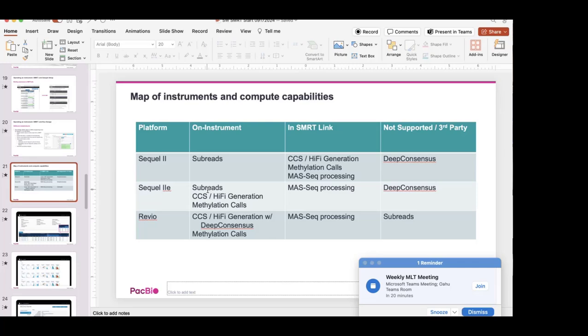And then what CCS is attempting to do is align them against each other, not against a reference genome, but all these reads against each other to generate a consensus, because there will be some random errors in the sequencing or the base calling. The intent is that by sequencing it in a circle, circular consensus sequencing, that's what it stands for.